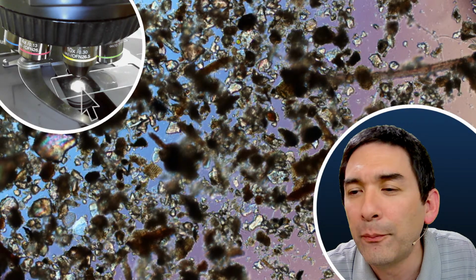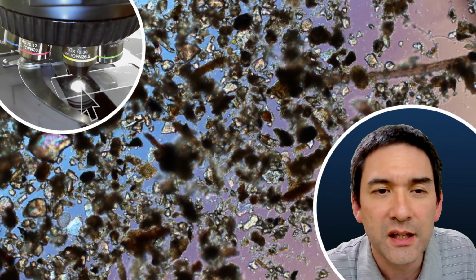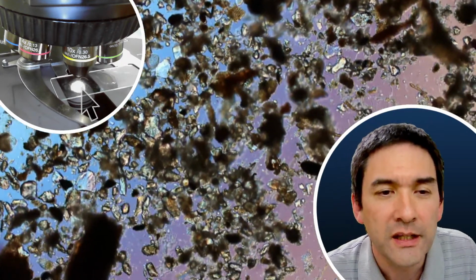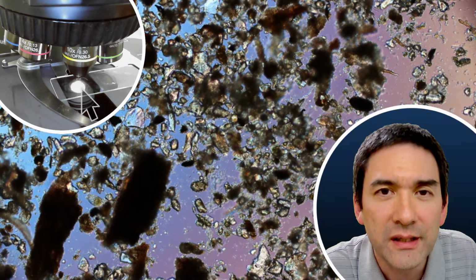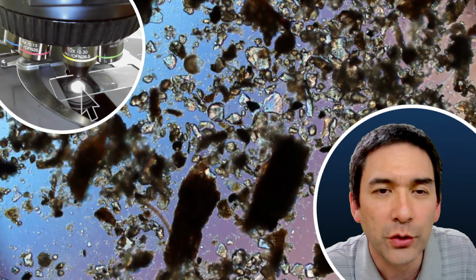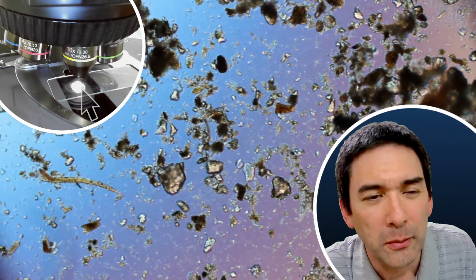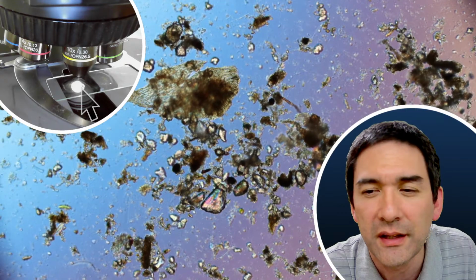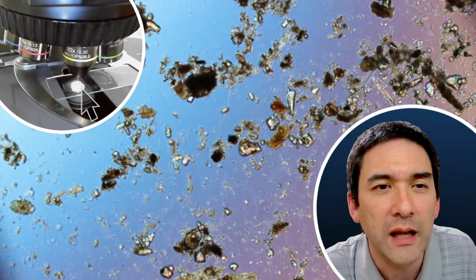Do you use regular tap water to put on the moss? Yes, I just use regular tap water. This is perfectly fine, unless it's chlorinated or there's some other stuff in it. It's fine because there are so many impurities in the moss and in the soil of the moss that it's not going to be an osmotic problem. Distilled water I probably would not use, because there are really too few minerals. But regular tap water works.